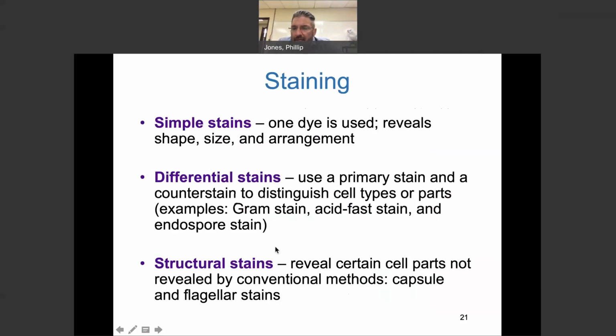So we're going to try to do that here with, I think we'll use Bacillus subtilis, something that can form an endospore. Those are really, really tiny. We wouldn't be able to see them with a microscope, but if I use a negative stain, I can stain the outside of it and we can tell what it is. So if we had a regular gram-positive rod, and then a gram-positive rod that has an endospore, we could distinguish them.